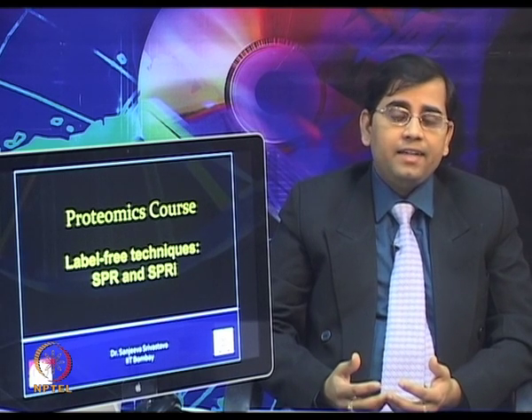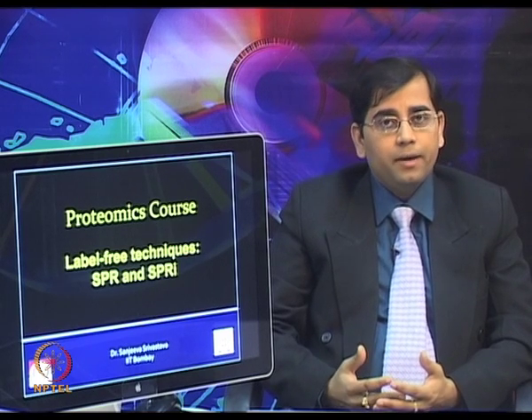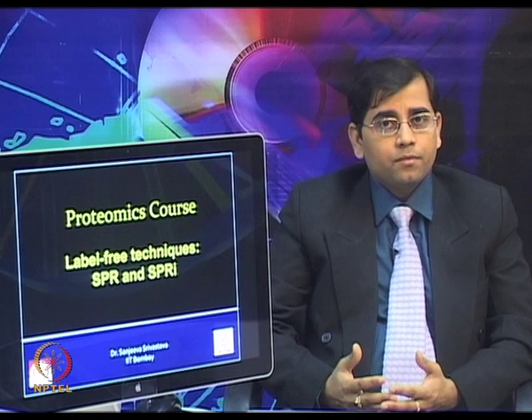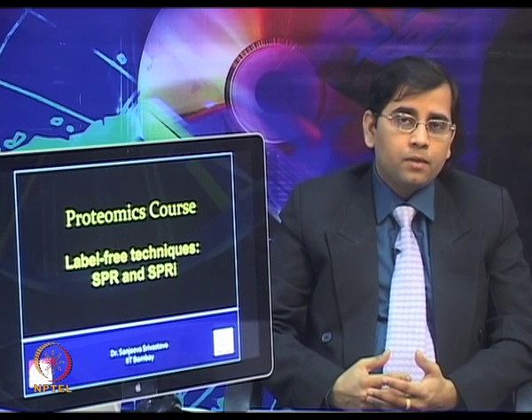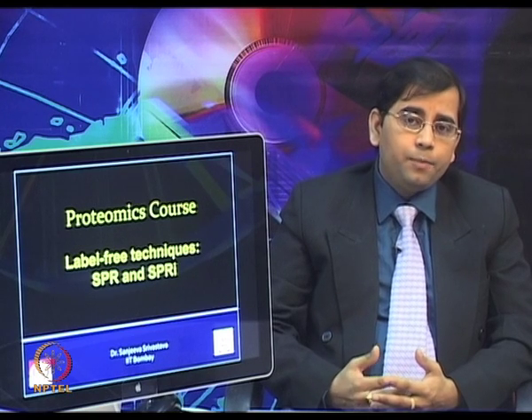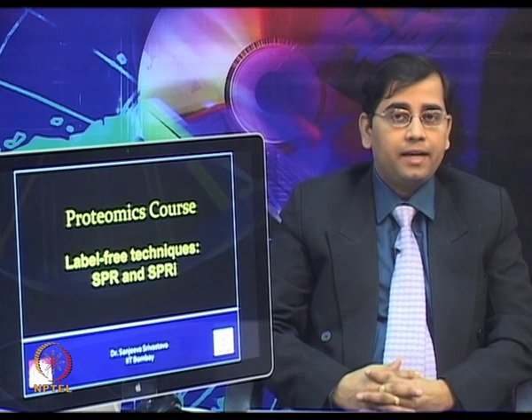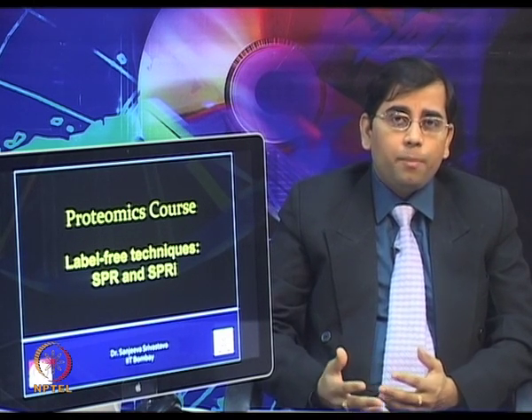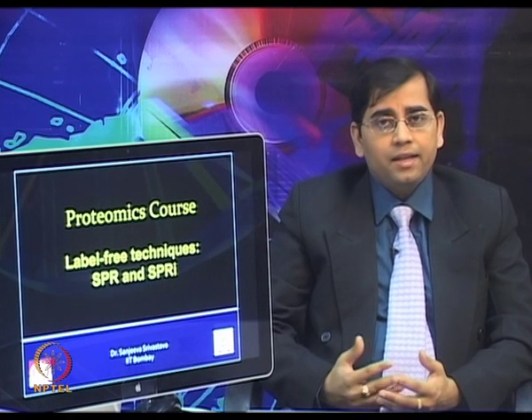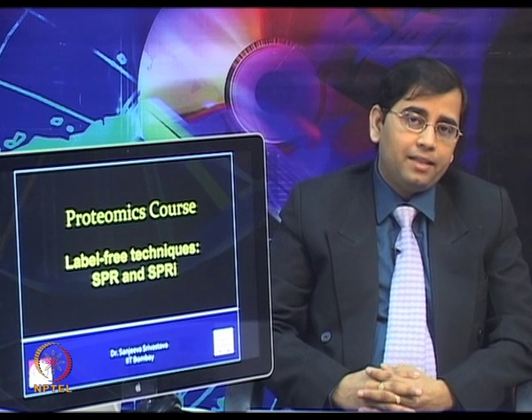The reflected light intensity from the illuminated area is monitored by the CCD camera, which produces an image in SPRi. SPRi is a potential alternative to the label-based detection techniques, and it offers nearly comparable sensitivity to single color as well as dual color labeling methods.